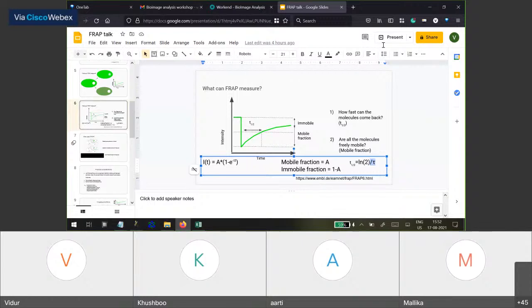Okay. Am I clear? Yeah. So I'm going to stop my screen share if no one has any other questions, and I'm going to just go to a breakout room to see if anyone has a bad formula in Fiji. Does anyone have any questions?